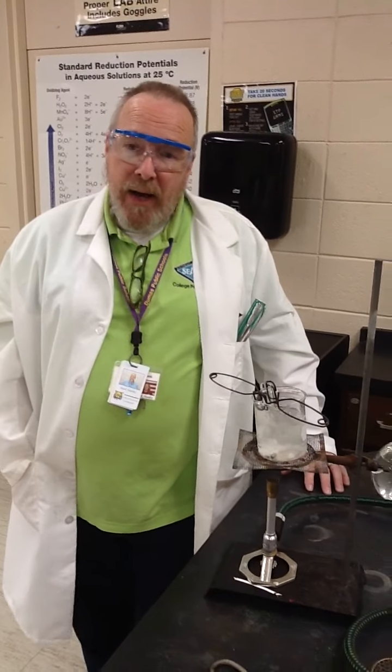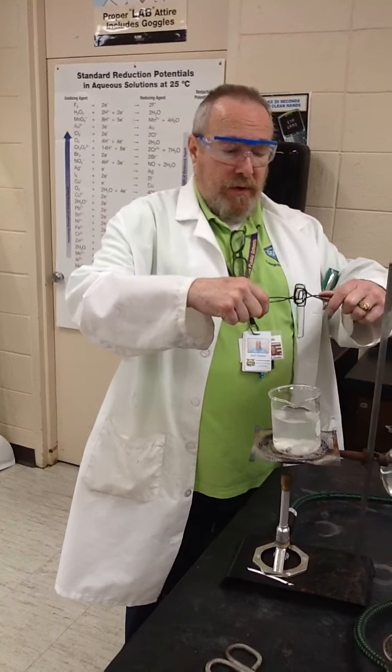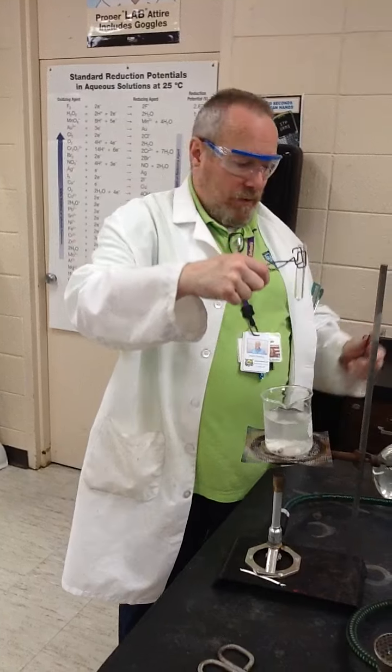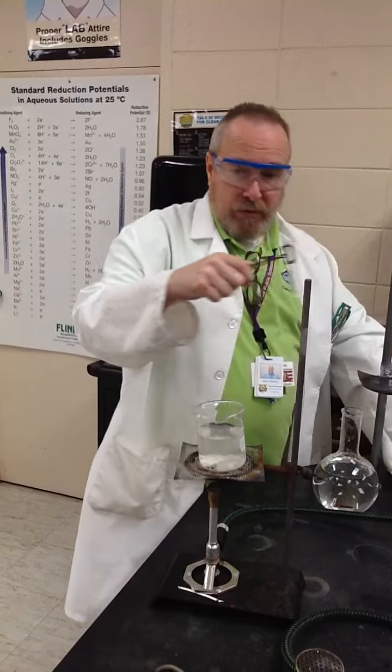One thing I'll warn you of is when it stops boiling, that doesn't mean it's not hot anymore. I can't just look at water or glass or steel and tell if it's still too hot to touch. Obviously, if it's red hot, it's too hot. Obviously, if it's boiling, it's too hot. Obviously, if it's steaming, it's too hot. But right now, this is very difficult to tell which one's the inside and which one's the outside. There we go. To tell if it's too hot to touch or not, I'm going to always assume it's too hot.